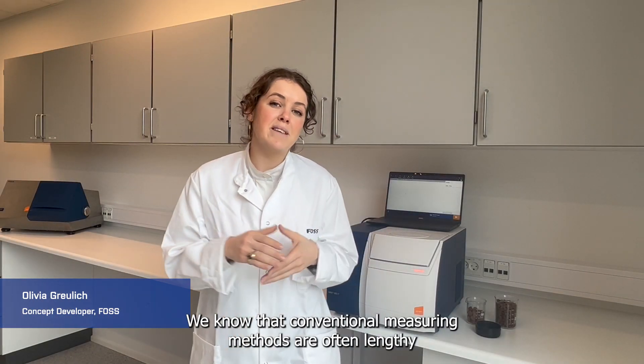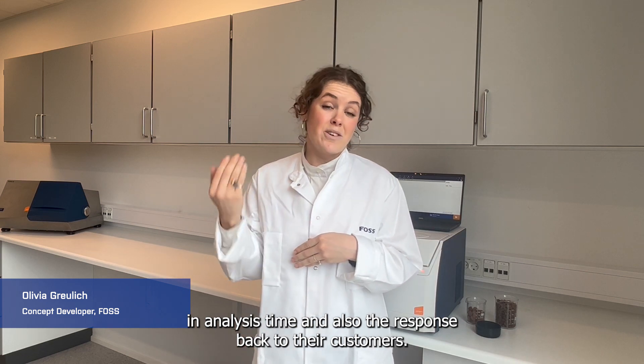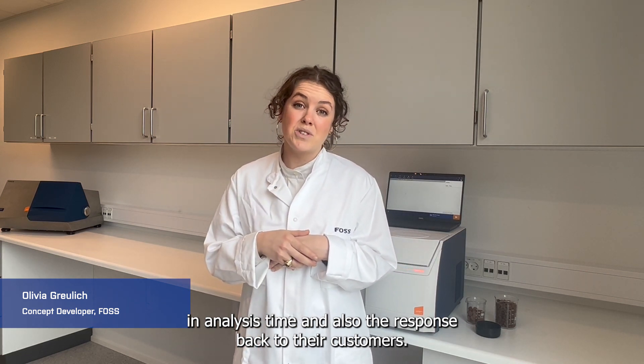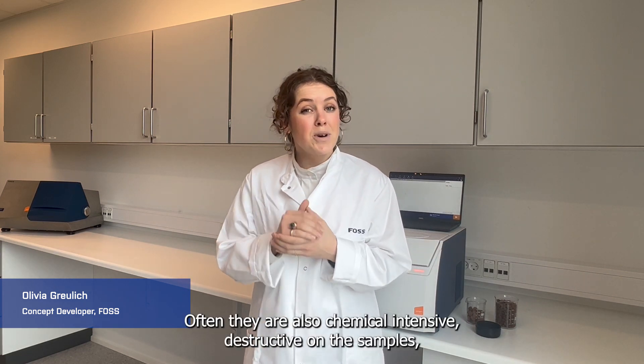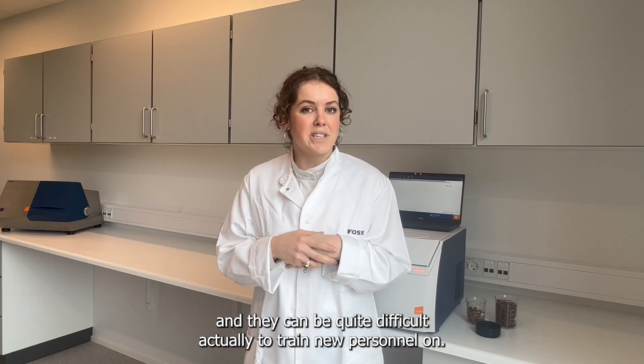Conventional measuring methods are often lengthy in analysis time and slow to respond back to customers. They are also chemical intensive, destructive on the samples, and can be quite difficult to train new personnel on.